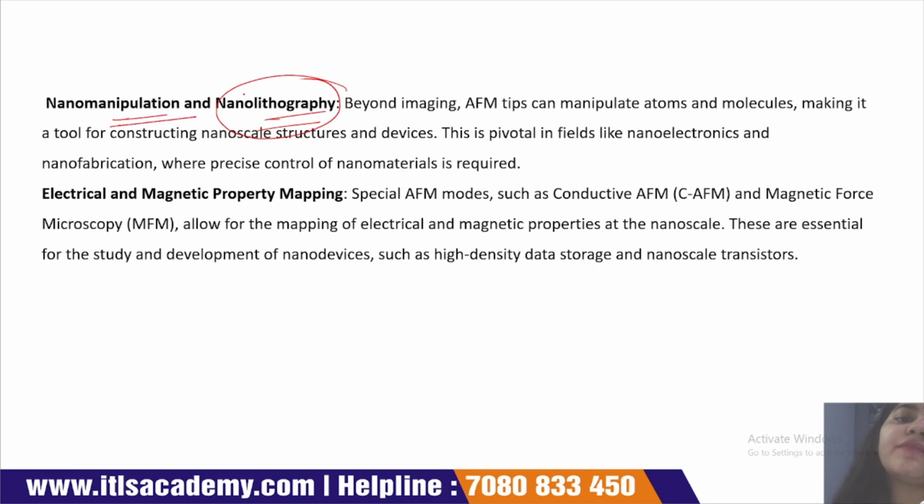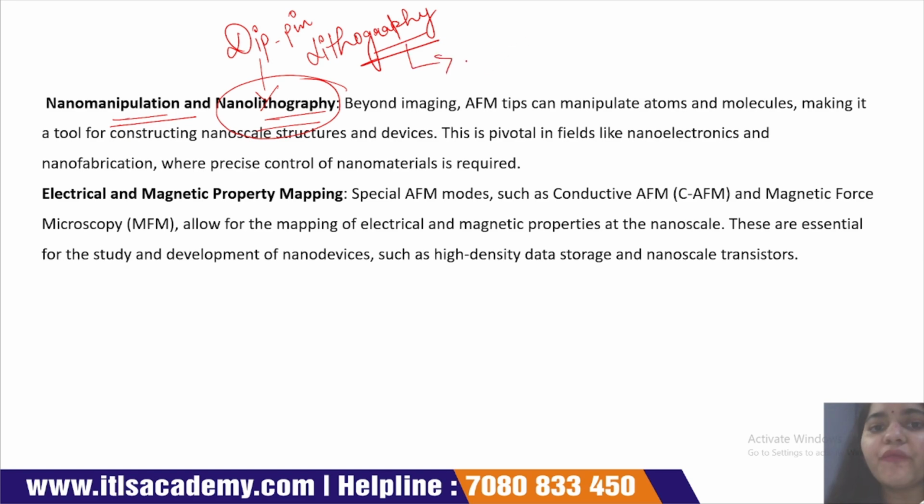Next is nanomanipulation and nanolithography. In nanolithography, AFM plays a most important role. A lithography technique is dip pen lithography. In dip pen lithography, the cantilever tip of the AFM plays a most important role, and this tip is also used for constructing nanopatterns. Beyond imaging, the AFM tip can manipulate atoms and molecules, making it a tool for constructing nanoscale structures and devices.